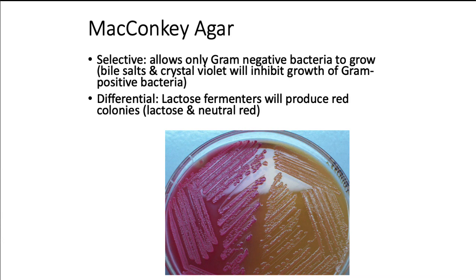The pH indicator here is neutral red. So as you can see, we have a bunch of different reds, phenol red, methyl red, neutral red. So just be clear which test uses which, but they are all looking for change in pH.